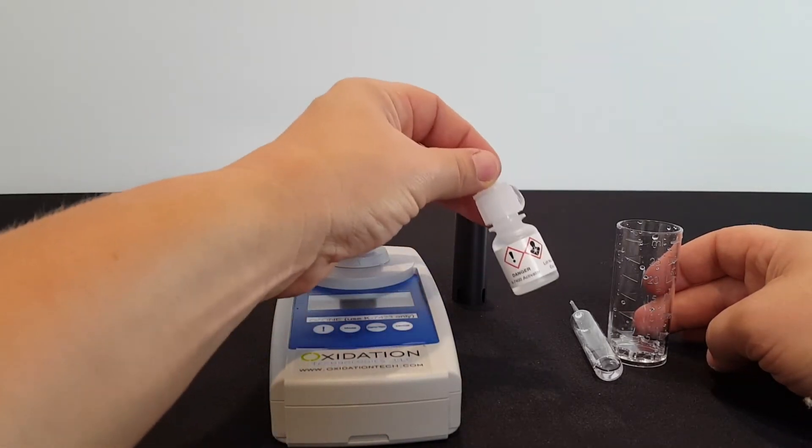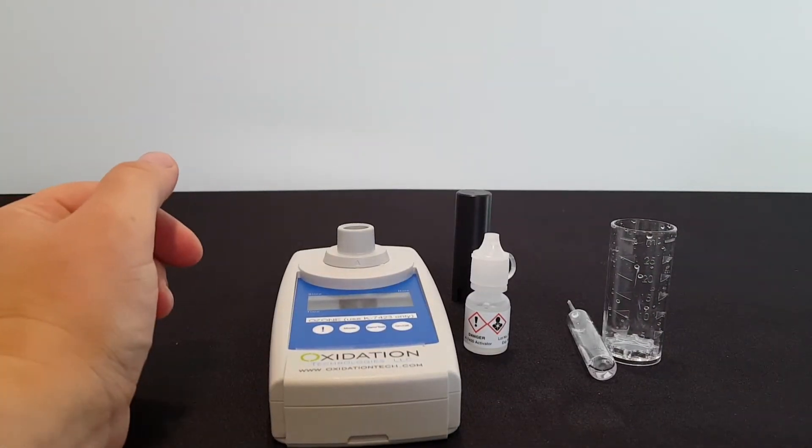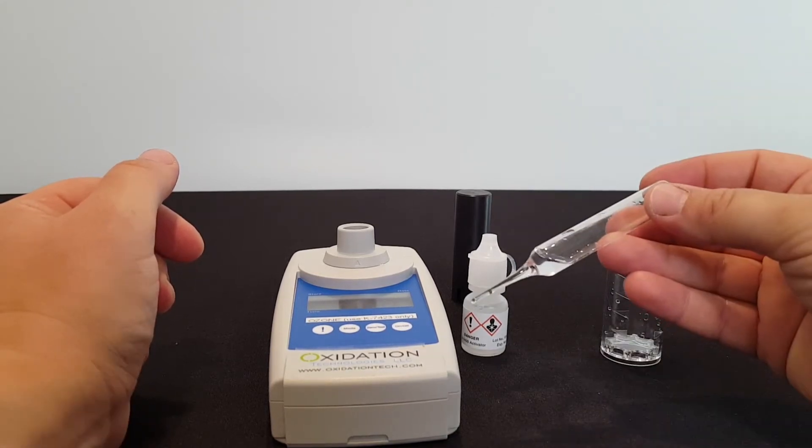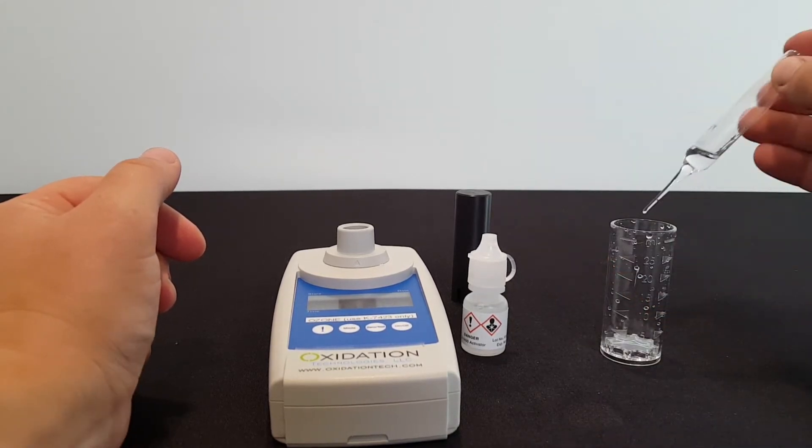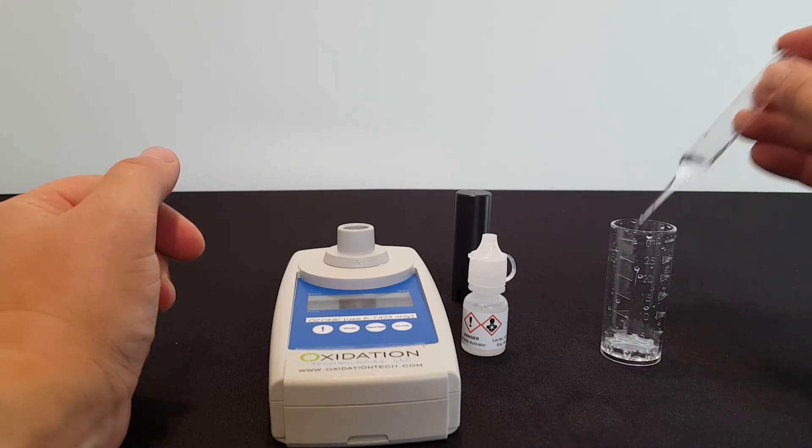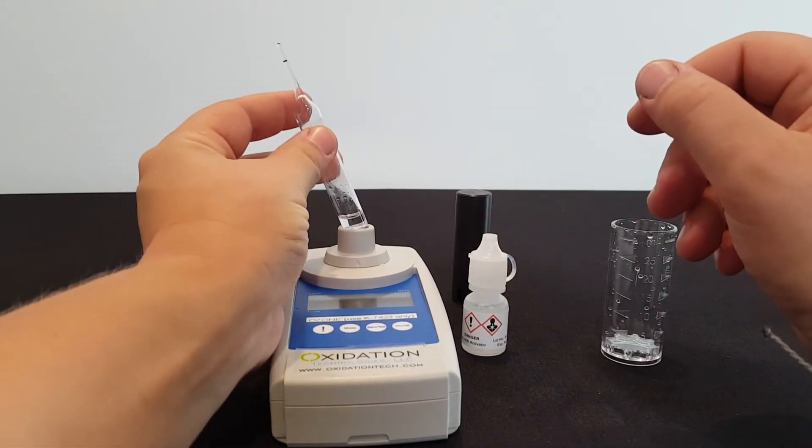So the first step is going to be putting five drops of activator solution in the test cup. The next step is going to be filling the test cup up to the 25 milliliter point, and then I am going to put this vacuum sealed ampoule inside the sample, snap the tip off. It will immediately fill with the sample, and then I'm going to put this in the meter and measure the ozone.